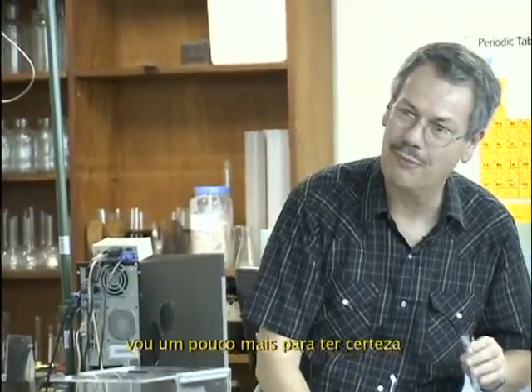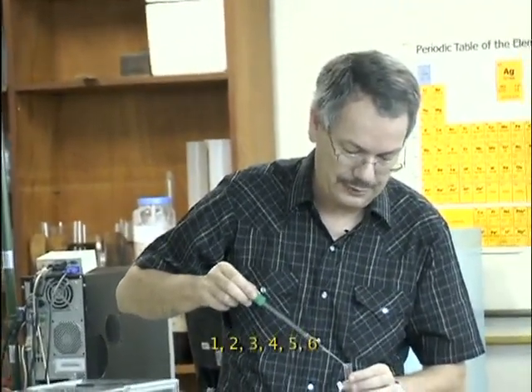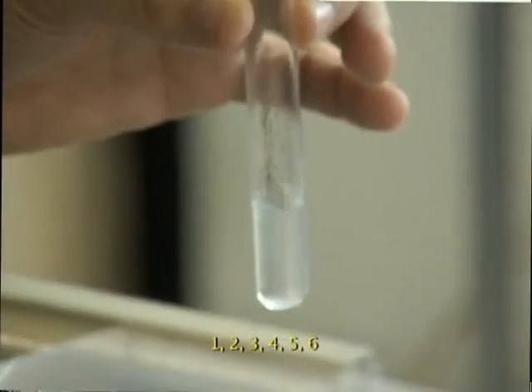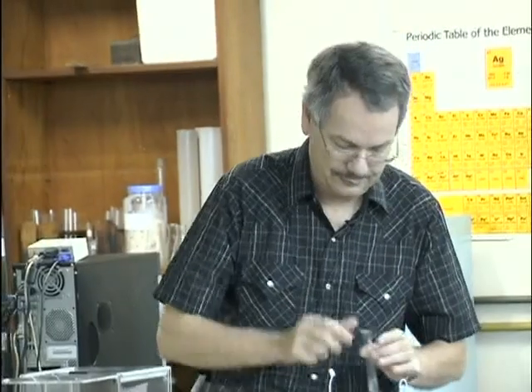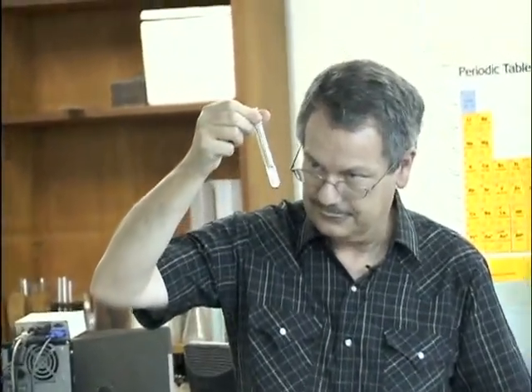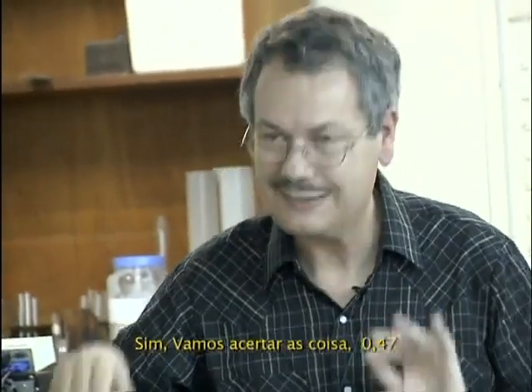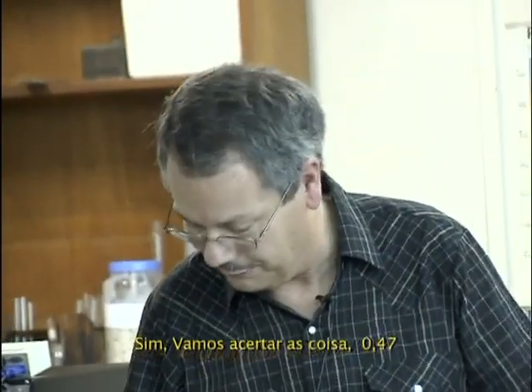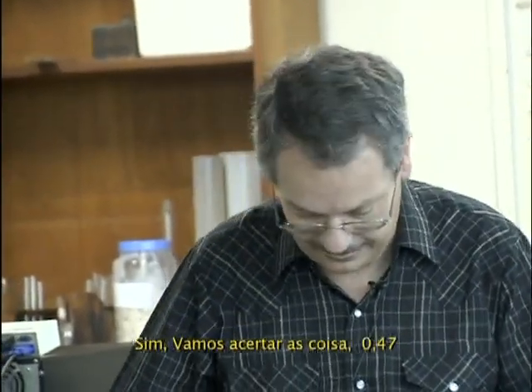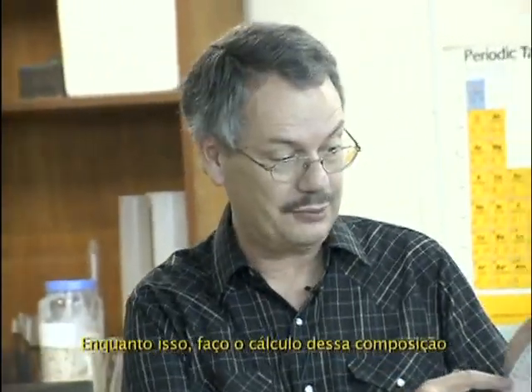I'll go a little bit more to be sure. 1, 2, 3, 4, 5, 6. Yes. So let's settle the things. 0.47. Meanwhile, I'll make the calculation on that composition.